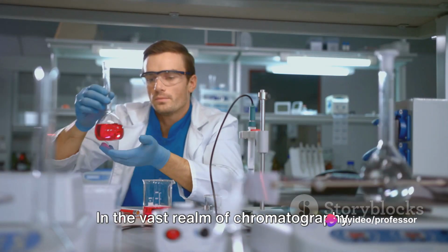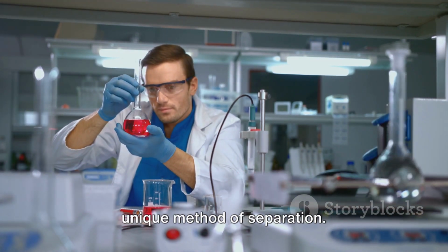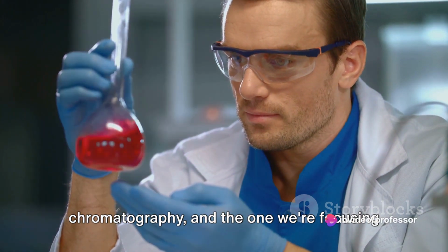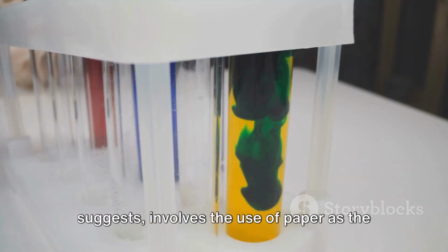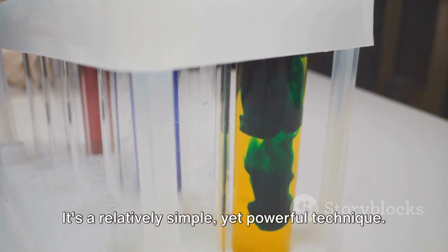In the vast realm of chromatography, different types exist, each with its own unique method of separation. These include gas chromatography, liquid chromatography, and the one we're focusing on today, paper chromatography. Paper chromatography, as the name suggests, involves the use of paper as the stationary phase. It's a relatively simple yet powerful technique.